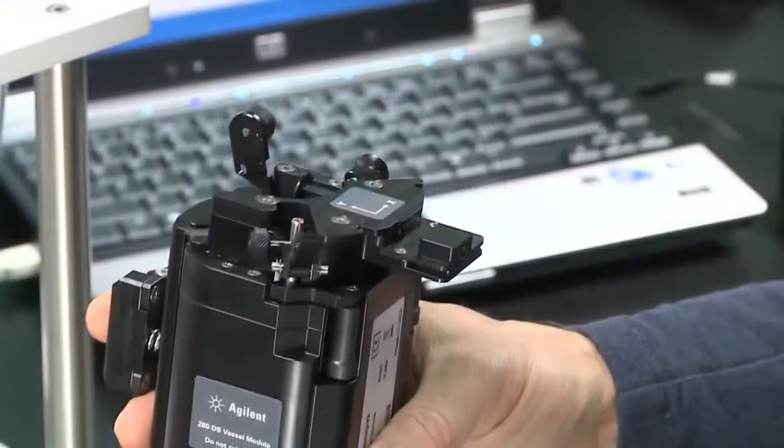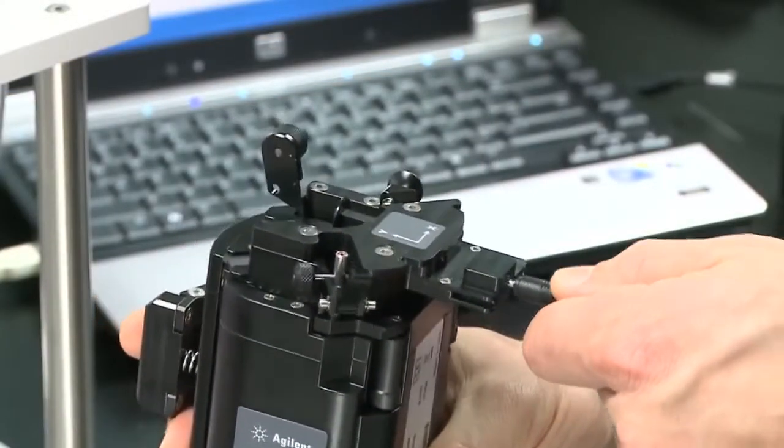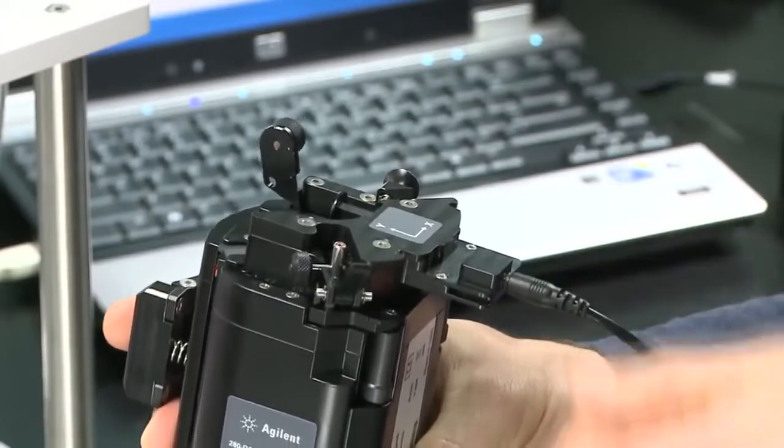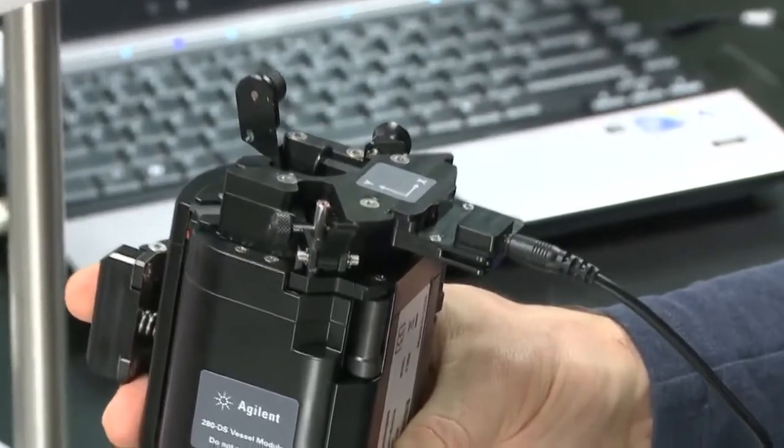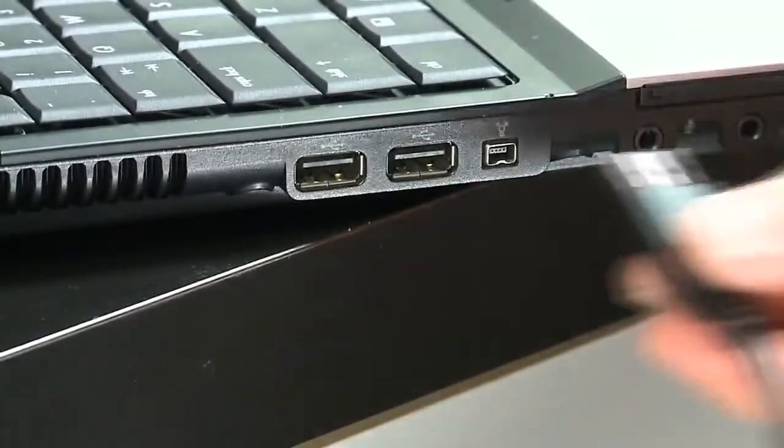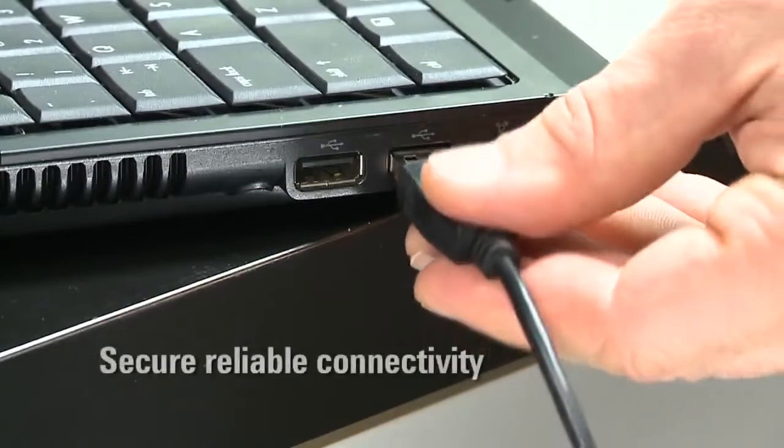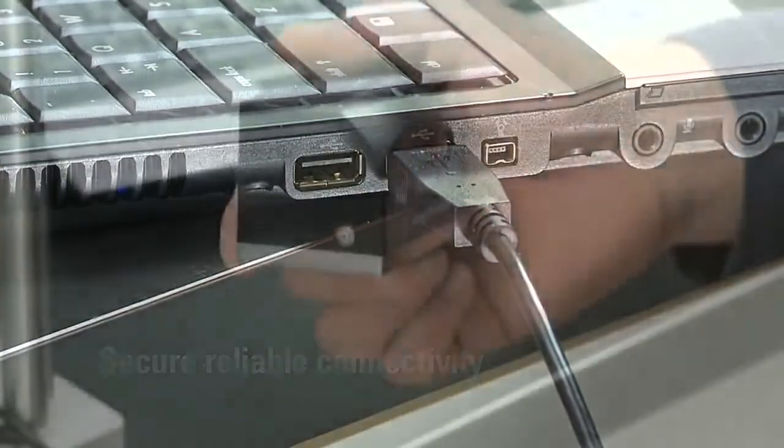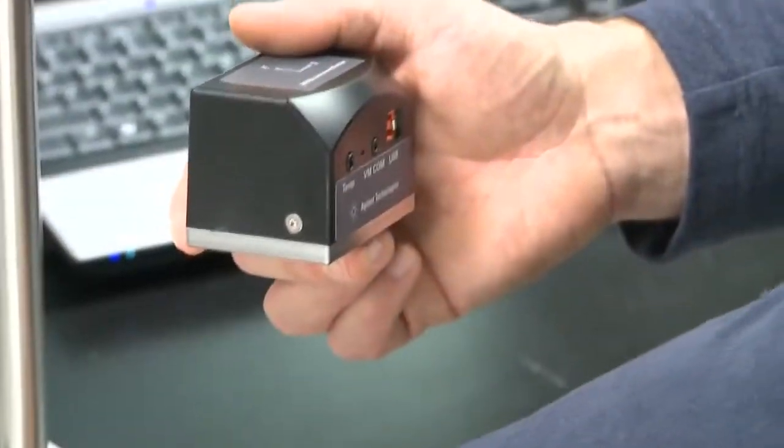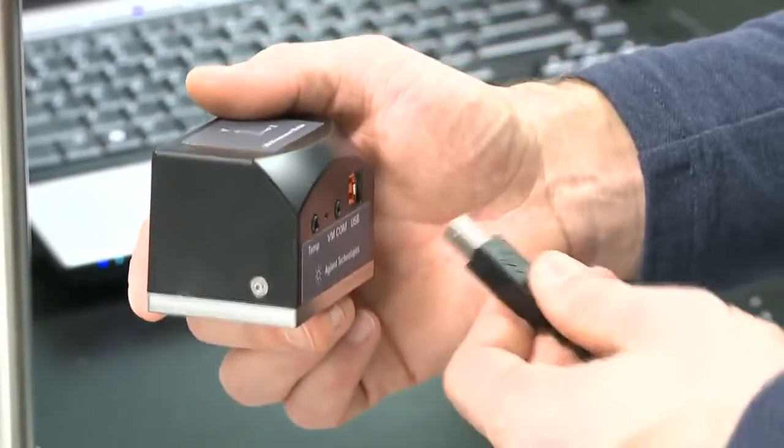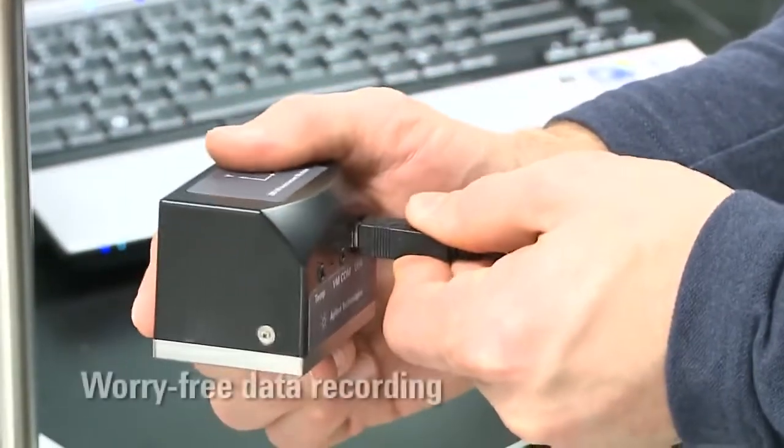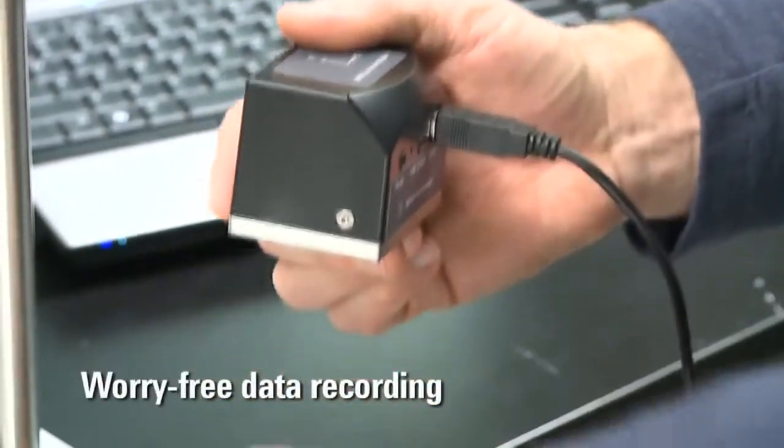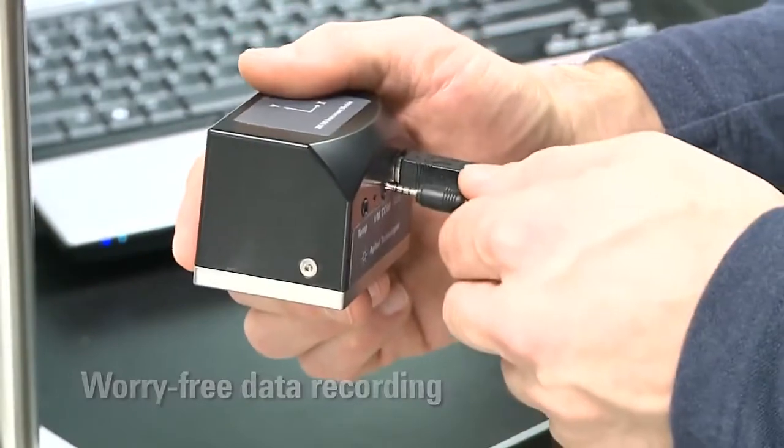Rather than using wireless or battery operated technologies, the 280DS uses a single connection to the PC to transfer data in real time. Simply plug in your 280DS and rely on accurate data capture capabilities with no need to worry about battery life.